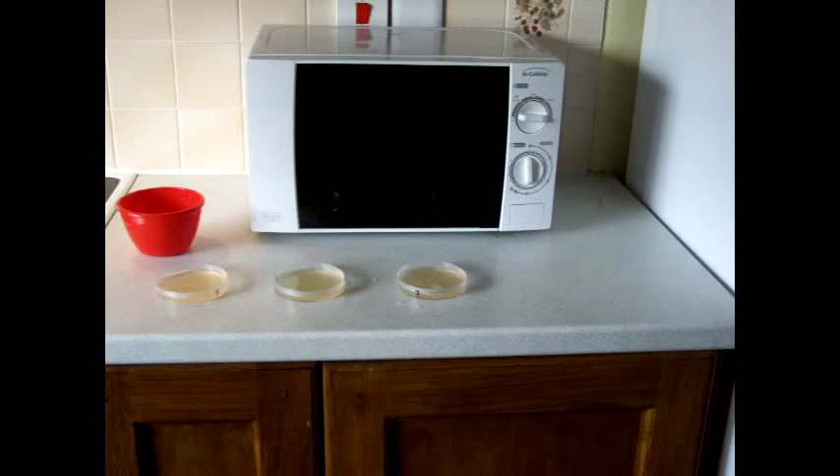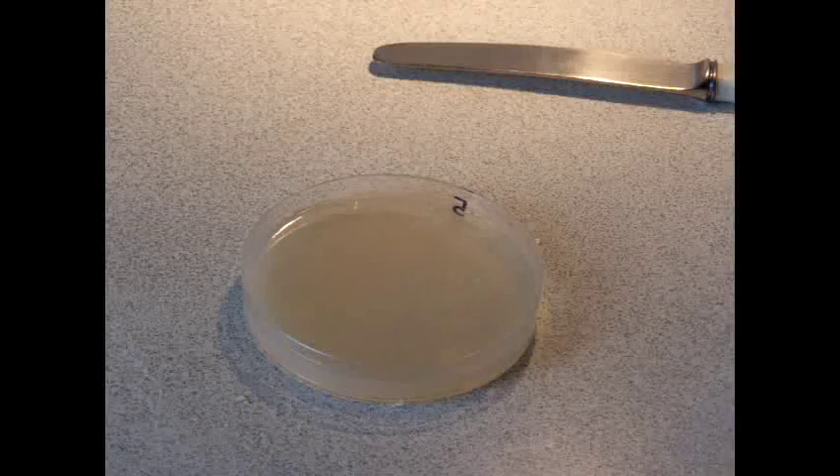Leave these to cool in the refrigerator for about three to four hours until they've set hard. After spending a couple of hours in the fridge, the agar solution has gone hard.